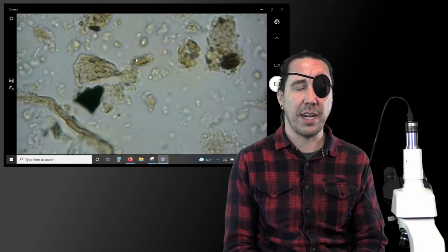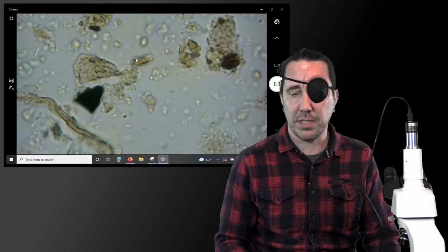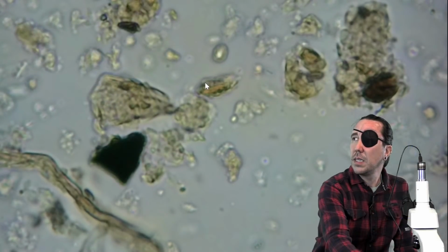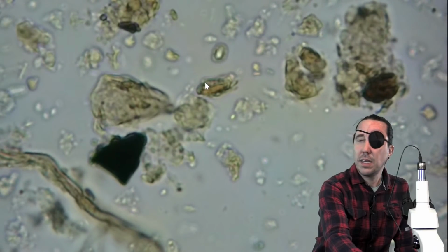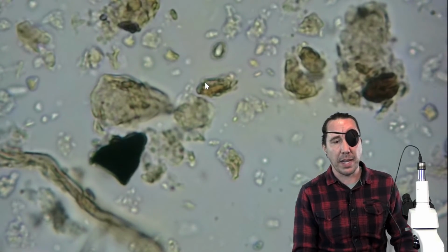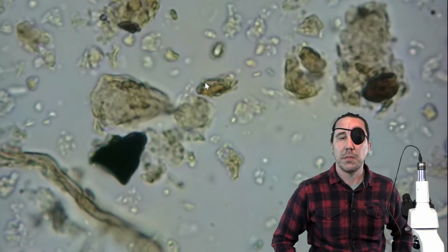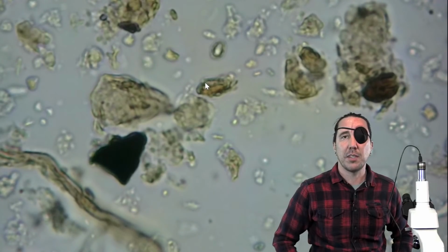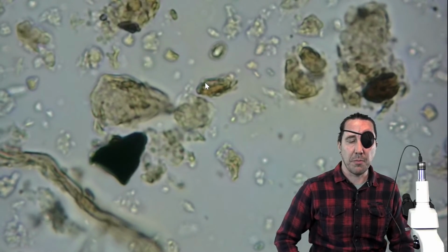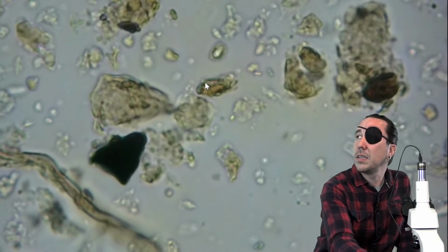I'm actually about to upgrade. It's been a long time coming that I've needed to upgrade a microscope. And then the camera, well, this is Dan's camera. My camera was not working, but usually, just like with other cameras, the more pixels that you can get, the better your camera is going to be, and the more money you spend on your camera, the better it's going to be.